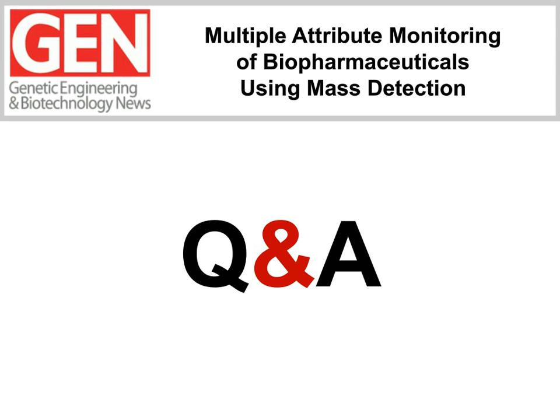Okay, Sean, let's get to our first round of questions here. Our audience member would like to know, can QDA be controlled by MassLynx so both data collection and processing can be streamlined? Yes, so the QDA can be controlled in Empower, as I discussed, but also in MassLynx. So the answer is yes. The instrument can be controlled in both of those chromatographic data systems.